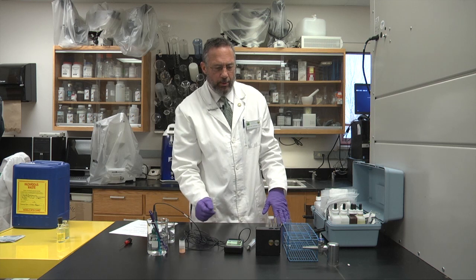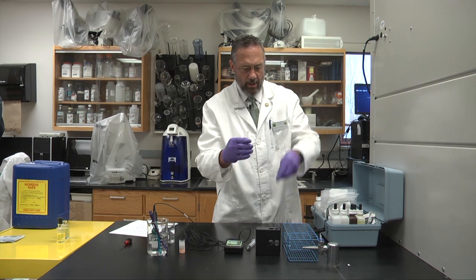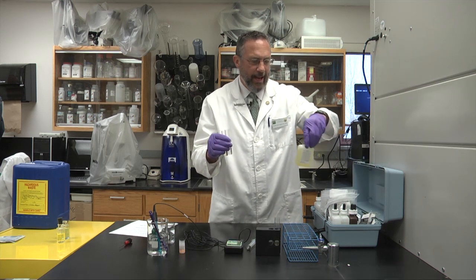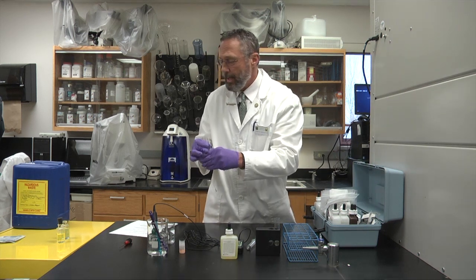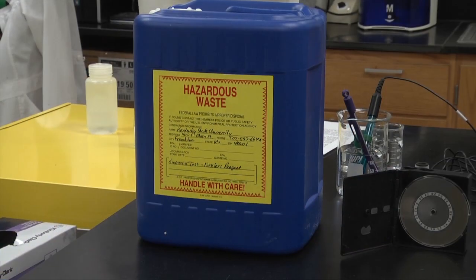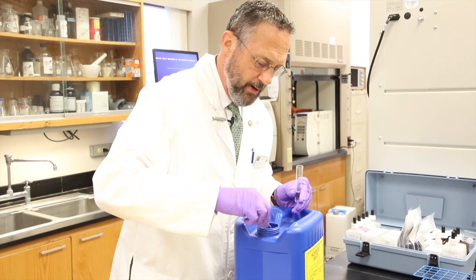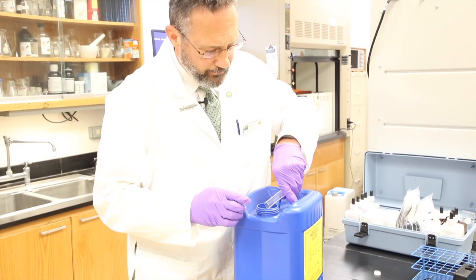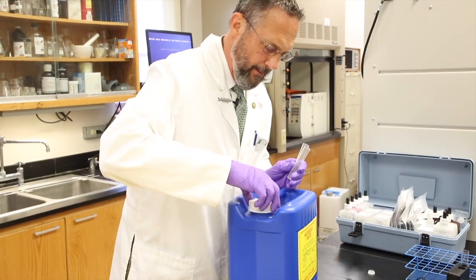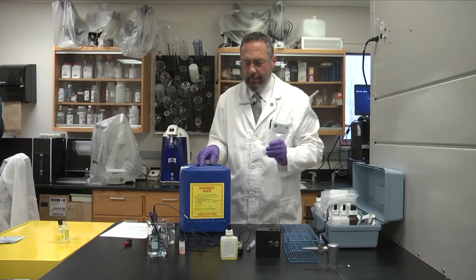When we're through with these tests here, this is especially important when we're dealing with Nessler reagent. Nessler reagent, which we used in this test, has mercury in it. And this waste container here is specifically designed to hold mercury waste from the Nessler reagent. And these are very important procedures to do because we don't want to contaminate our water supply. Or aquifers in the state might get contaminated if we simply dump these down the sink.